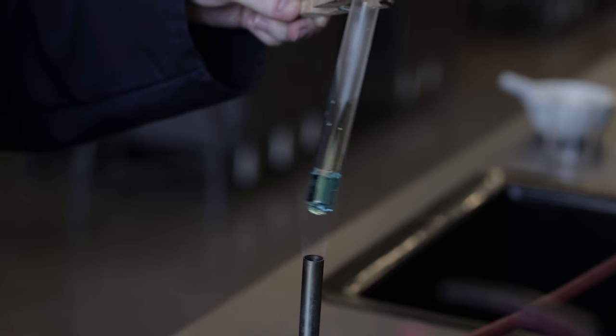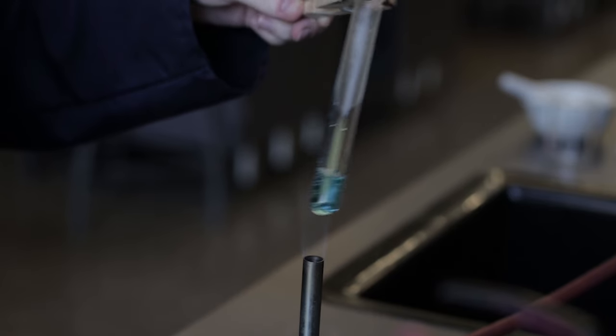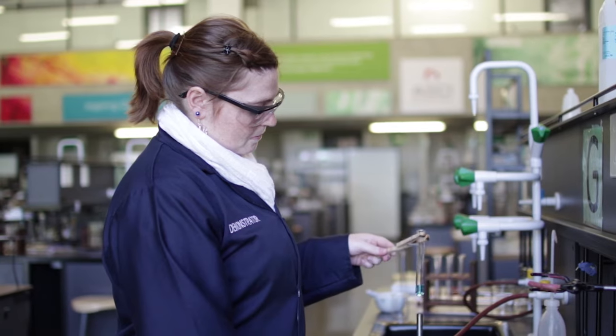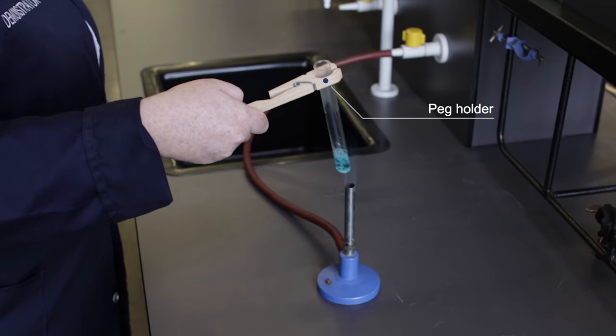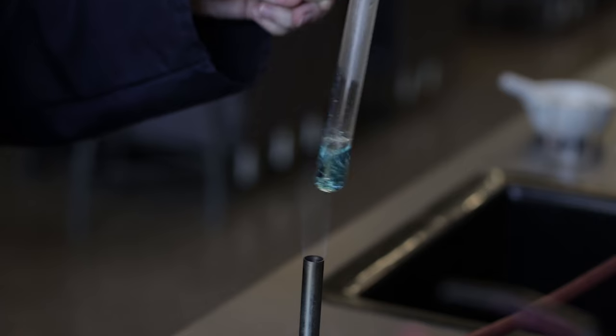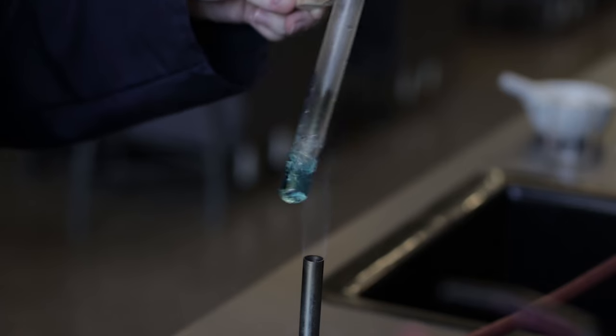A Bunsen burner is regularly used to heat solutions. Solutions in test tubes can be heated by using a wooden test tube peg holder and heating it in the flame. Always make sure that the test tube is not more than half full and ensure that it does not remain stationary in the flame.